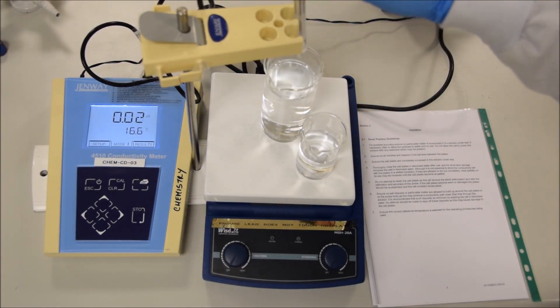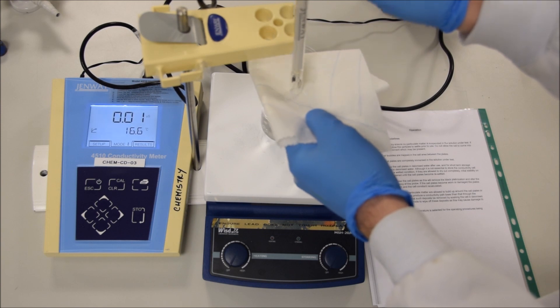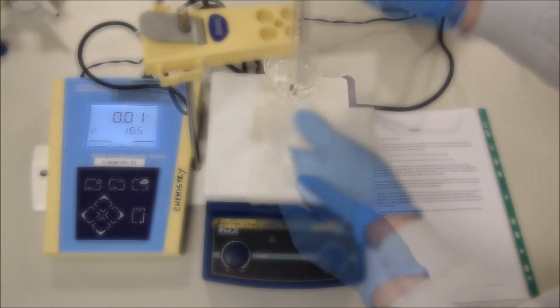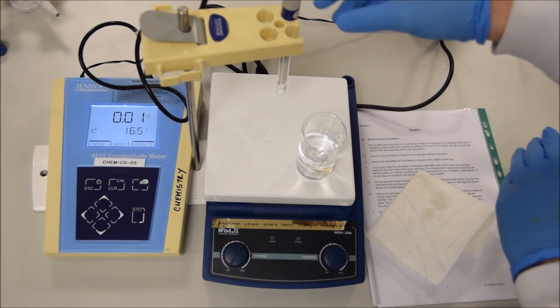As with any instrument, the first thing that we have to do is calibrate it. If we want to calibrate it, we're going to take it out of the water and dry it off. Those plates are quite fragile, so never put any tissue inside the instrument and simply pat it dry. And once you have it dry, then you can put it into your calibrating solution and begin the calibration procedure.